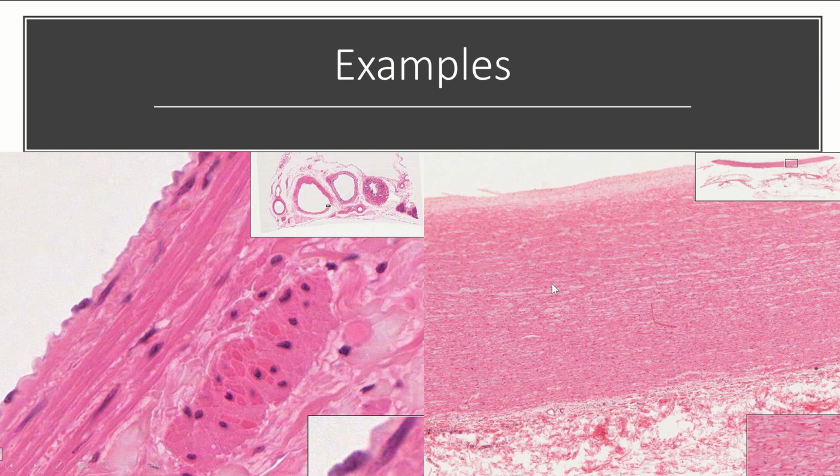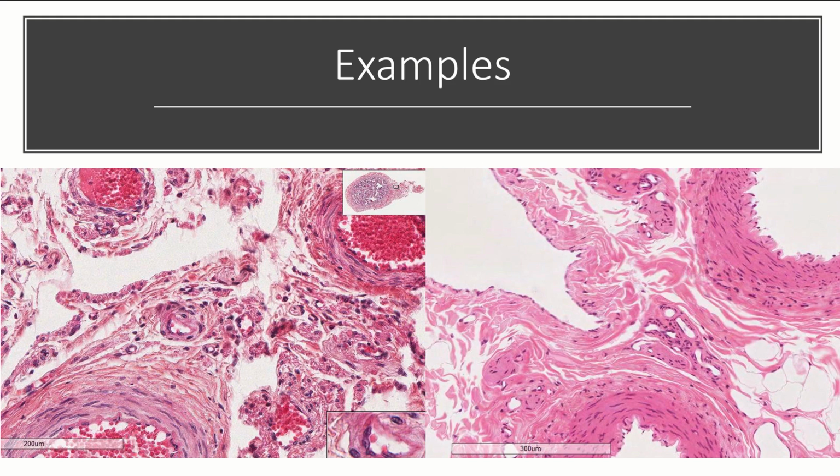And this is the aorta. Do you see how big this tunica media is? It is so much thicker. And these are relatively about the same size lumen-wise. But this artery has way more support on it, and that's because it has to deal with that pulse that a vein does not. There is no pulse in your veins, but there is a large pulse in your arteries. Okay, and then you can also see there's elastic fibers. These swirly things mixed in throughout the smooth muscle, those are the elastic fibers. And again, that helps with the springiness and the stretchiness of that artery.